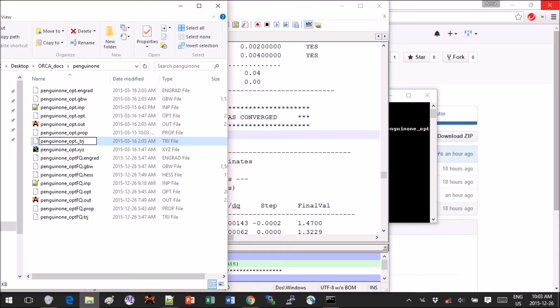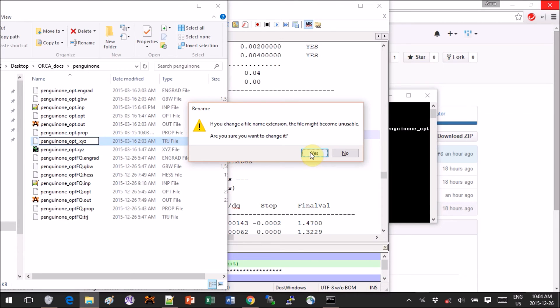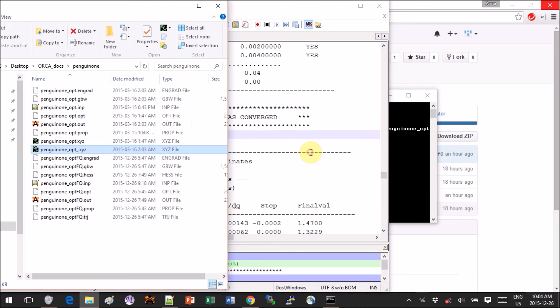Instead of the trj put xyz extension and hit enter. You will get this warning saying that are you sure you want to change the extension because you can corrupt the file, but there's nothing to be corrupted really, it's a text file, so don't worry, click on yes. And now we can open this file in Avogadro.